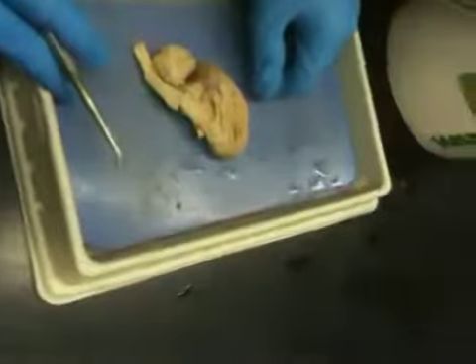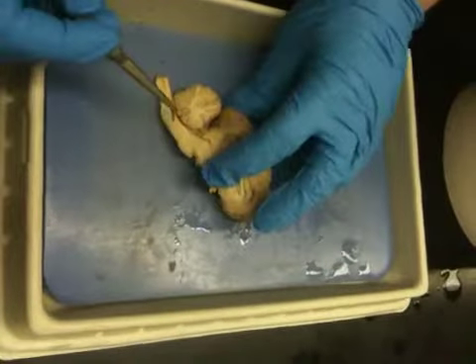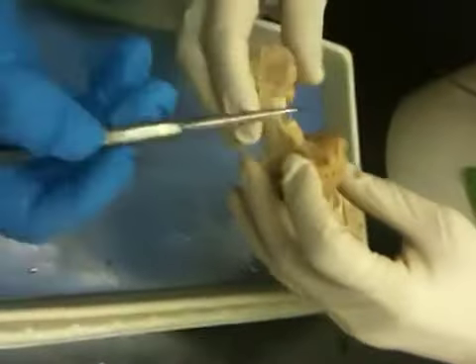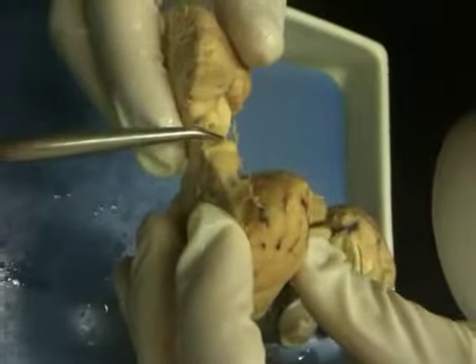Okay, what's the mesencephalon? The mesencephalon is this area of the brain right here, technically speaking. You start with the tectum, with rostral and caudal colliculi. These here are the colliculi. There's two. The rostral is larger, and the caudal is behind.